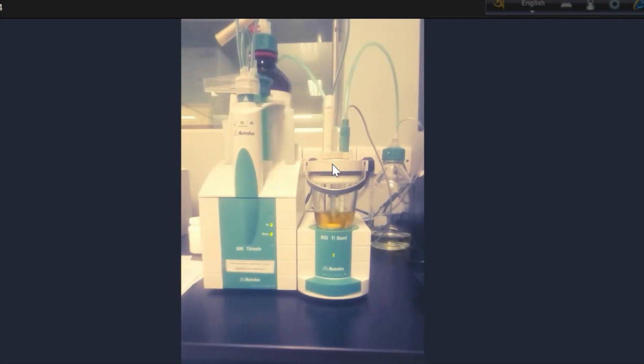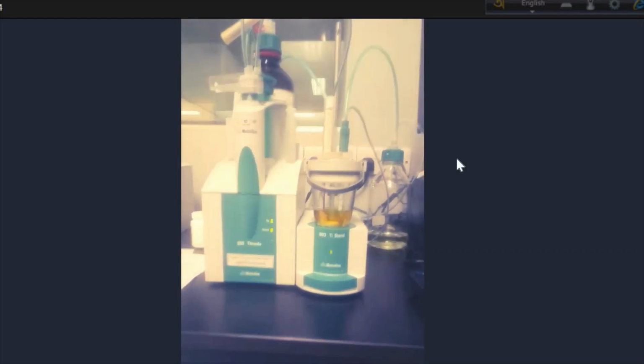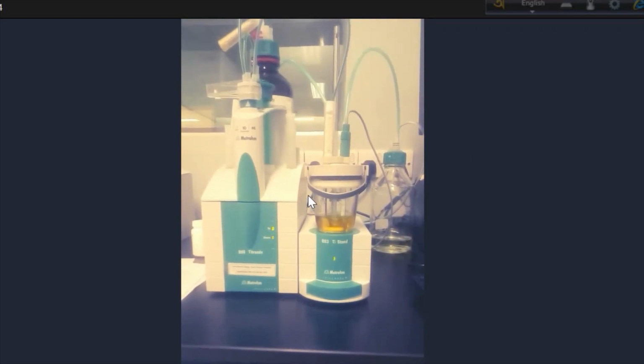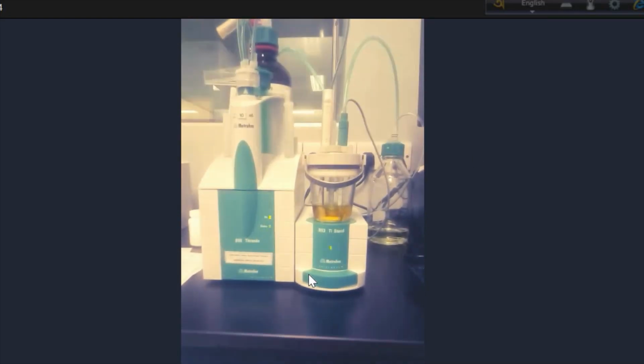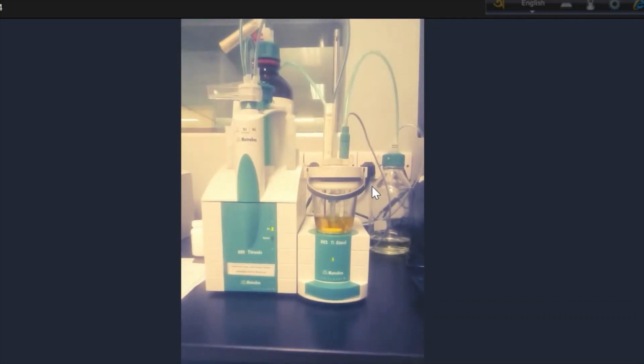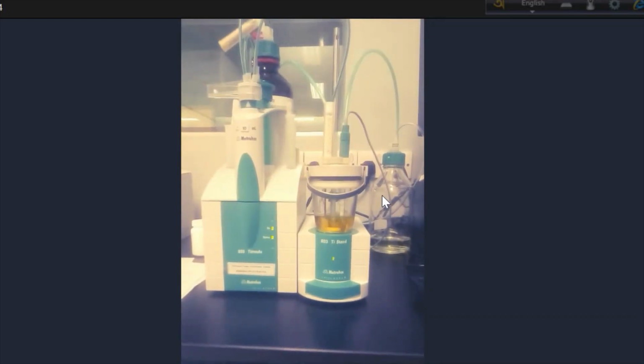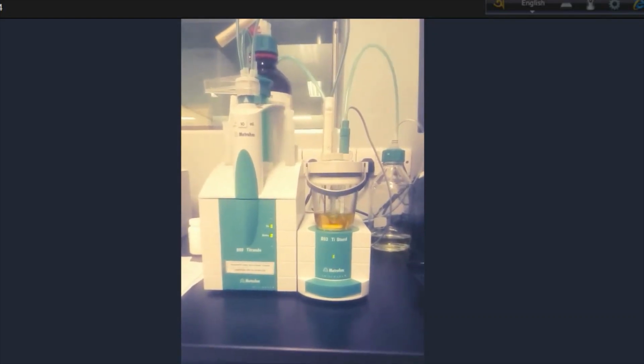We inject the sample here, and it works very sensitively, and finally we determine the water content of the sample. So this is about the Karl Fischer titration.